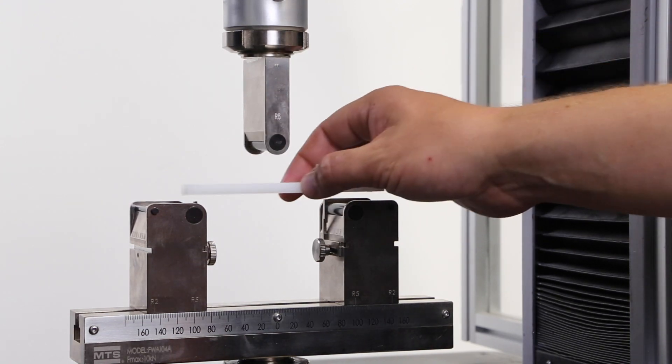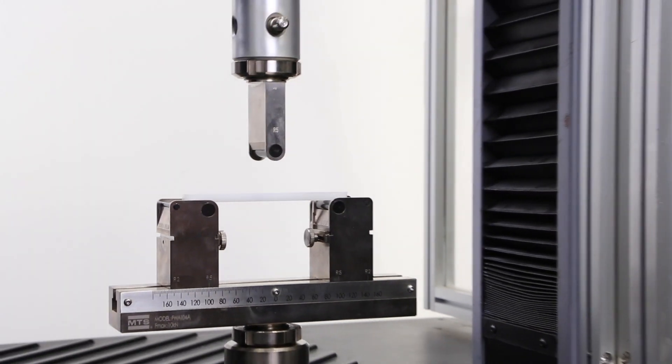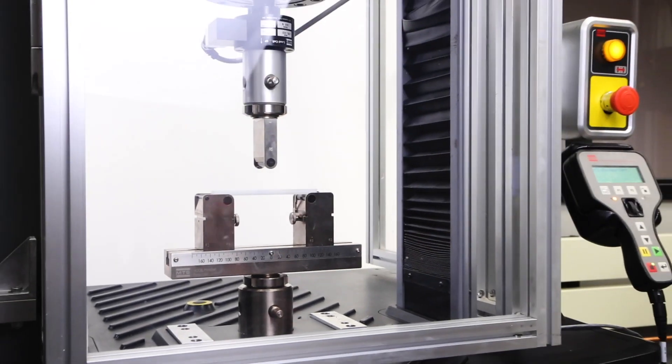The specimen is placed in the testing area and centered under the upper fixture. To assist with this, our bend fixture has integrated alignment pins.